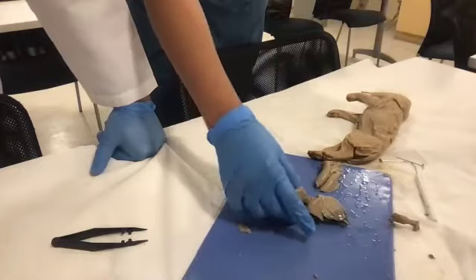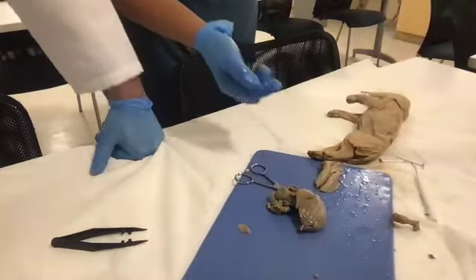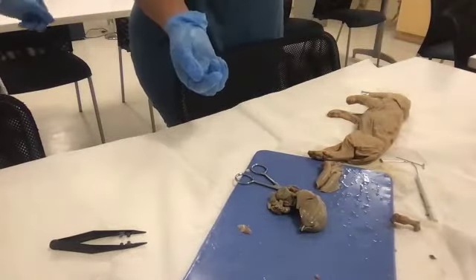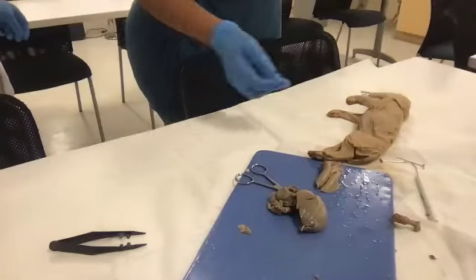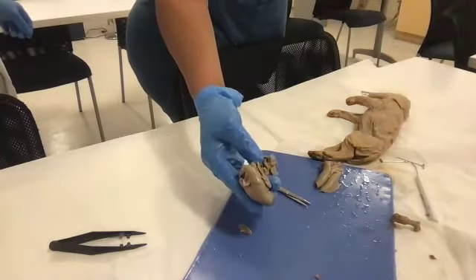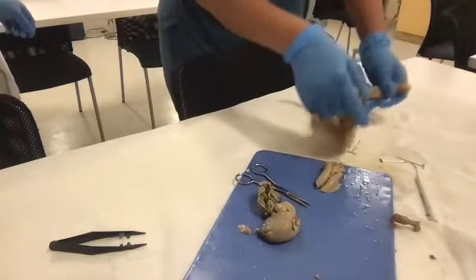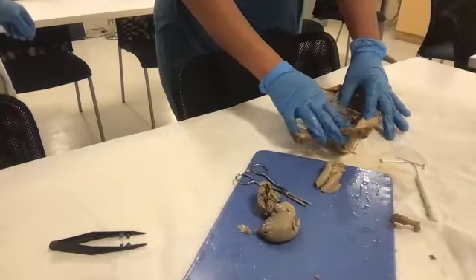The stomach is so small. Well, it's small compared to, it's not small compared to the size of piggy. I believe it's empty. No, it's got some stuff in it, and that's what I'm going to show you in a minute. But yeah, it's relatively empty, because of course it's a fetal pig. Their gastrointestinal system isn't quite functional because it wasn't born yet and wasn't eating yet.